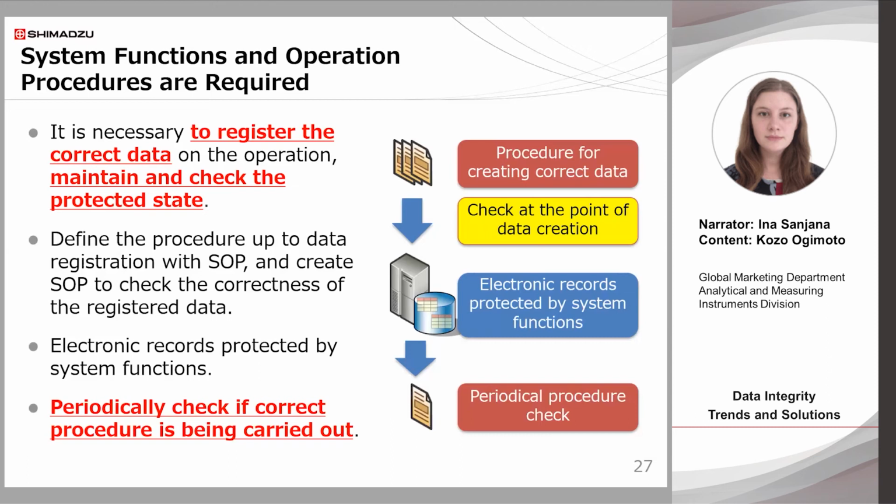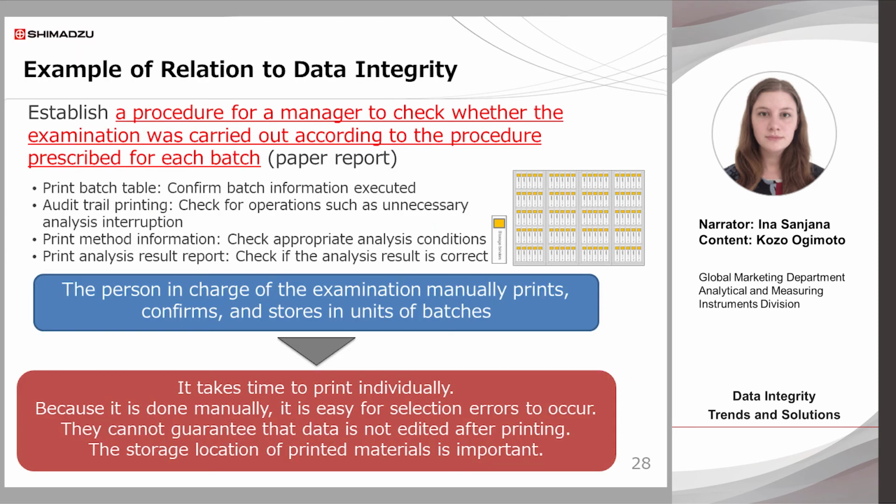As mentioned in the case of the Japanese authorities, it should be possible to confirm that the test was conducted according to the written procedures. That is, the authorities are asking for confirmation of logs and audit trails. This slide shows an example of how to check that testing has been carried out correctly on an LC or GC.